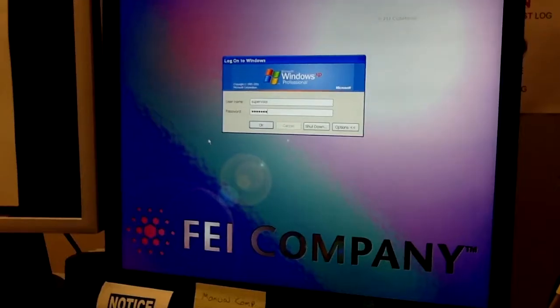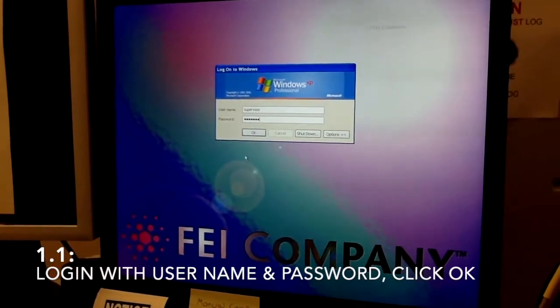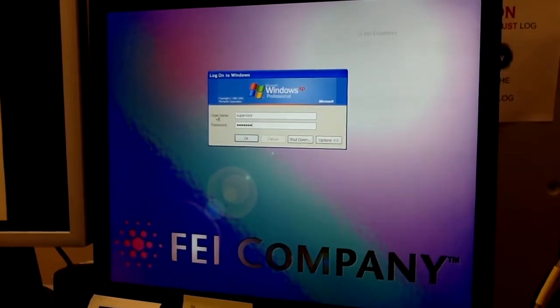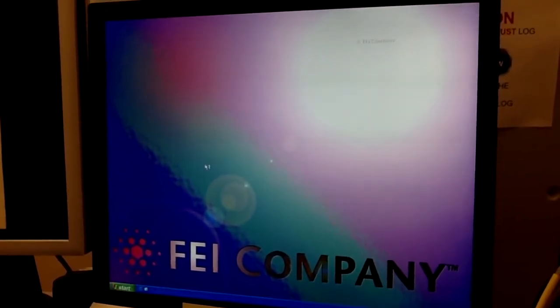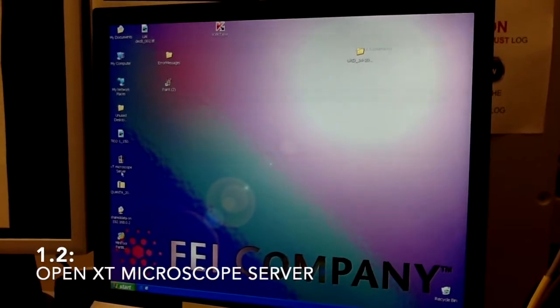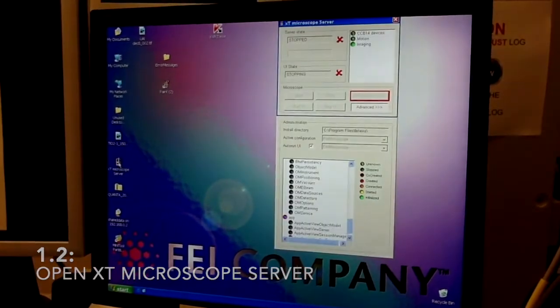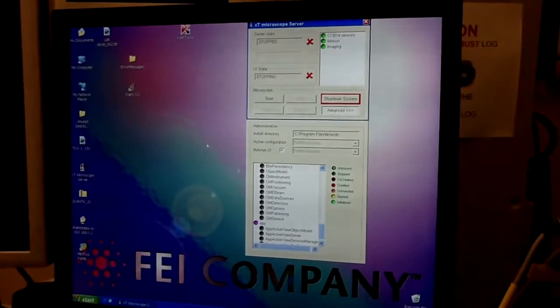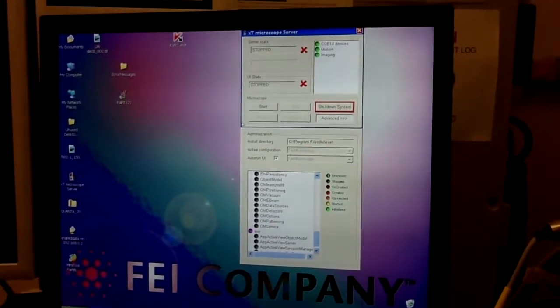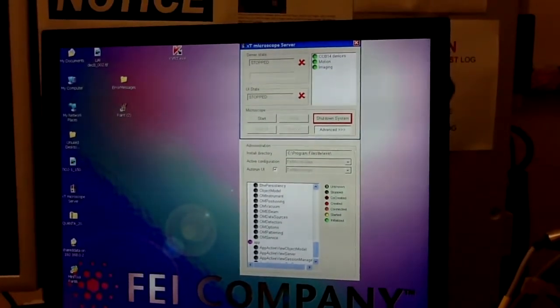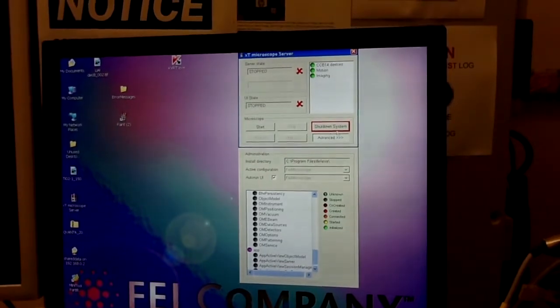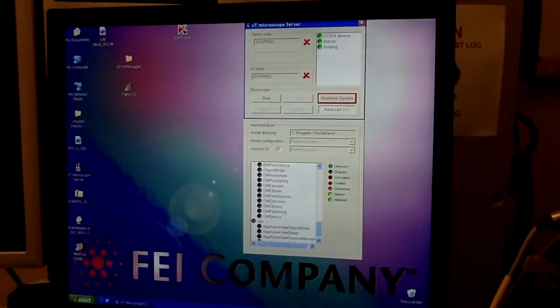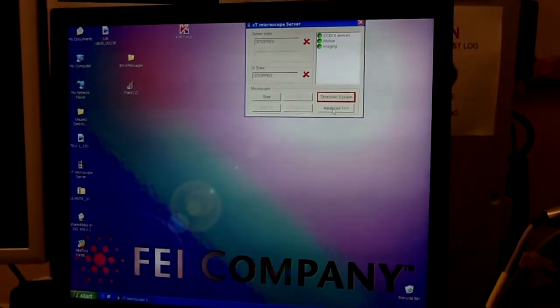The first thing you need to log in into your Windows account. Just type your username, password and then find this icon XT microscope server and open it. You will see this window. The only difference in your user account will be that you won't have this shutdown system button. Other than this, everything should be the same.